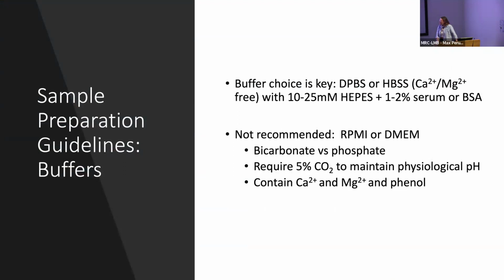Successful flow cytometry, and specifically successful cell sorting, really requires that you pay a lot more attention to sample prep than is probably typically done when you're just analyzing your cells, although you should also make sure that your cells don't clog the analyzers, so you don't get unhappy people who won't want to run their cells after you because you've been clogging the machine. But really the challenge lies in balancing your fractionation of your population of interest in a timely way to preserve viability, functionality, especially functionality, and expansion and culture for downstream assays.